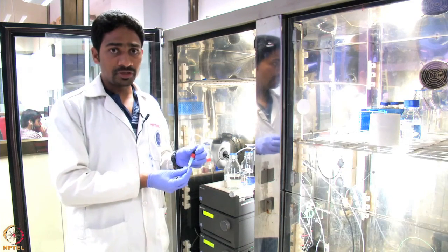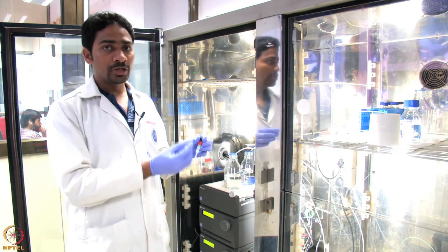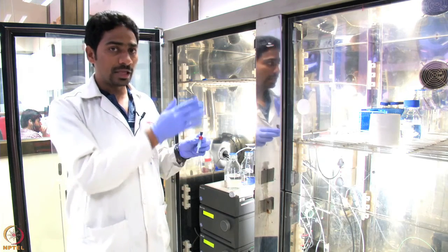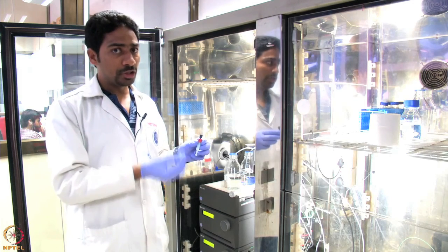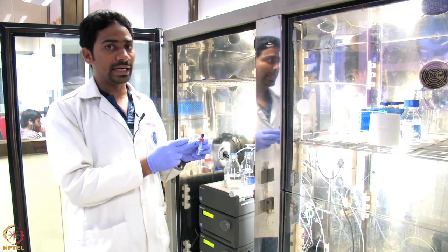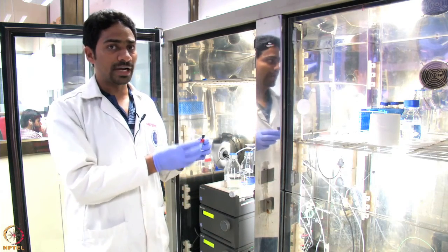So the proteins which have a His tag can bind to the nickel affinity column. The protein of interest, which has a His tag, binds to the column and other proteins come out. Then we put in a solution like imidazole, which can compete with the His-tagged proteins for binding to the nickel affinity column. In this way our protein of interest will come out and the imidazole will bind.